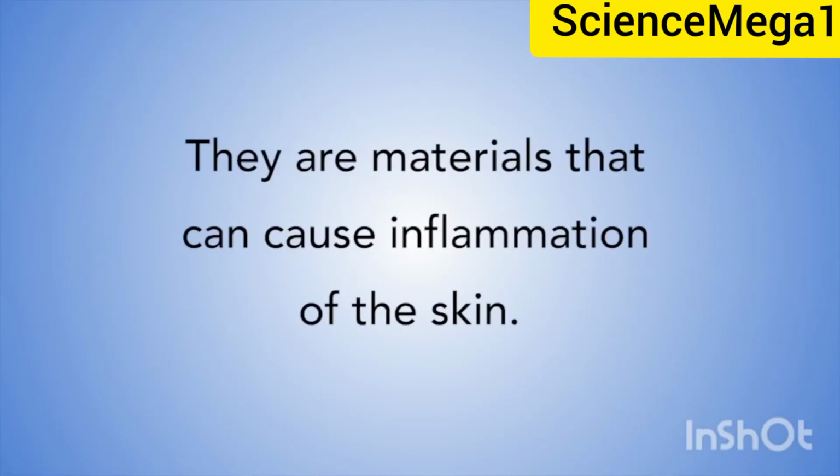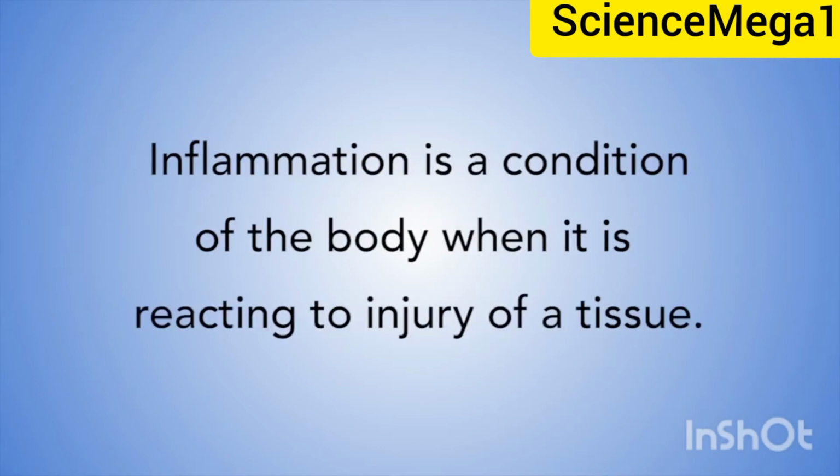Now let's look at irritants. They are materials that can cause inflammation of the skin. Inflammation is a condition of the body when it is reacting to injury of a tissue. The symptoms include reddening or blistering of the skin or swelling. The reagent bottles of irritants have the following hazard symbol.